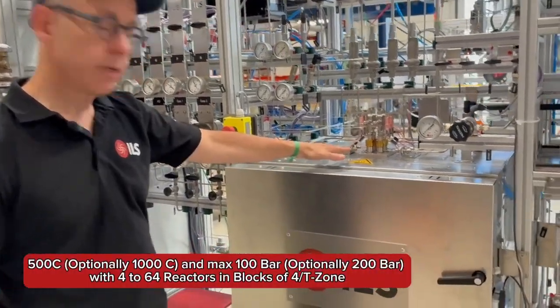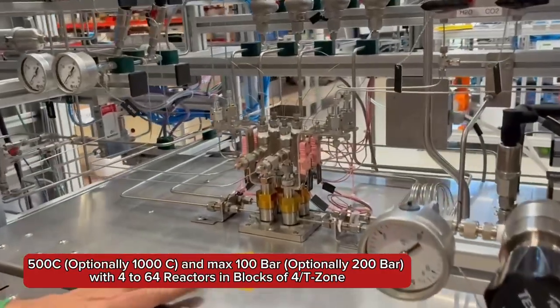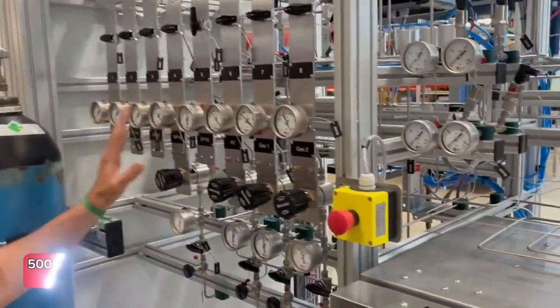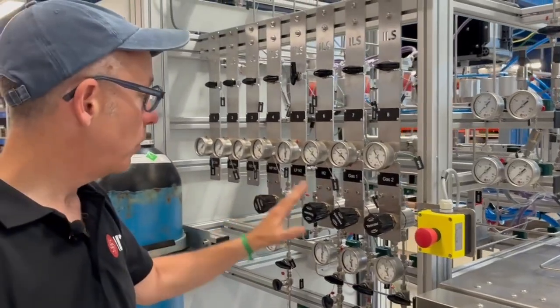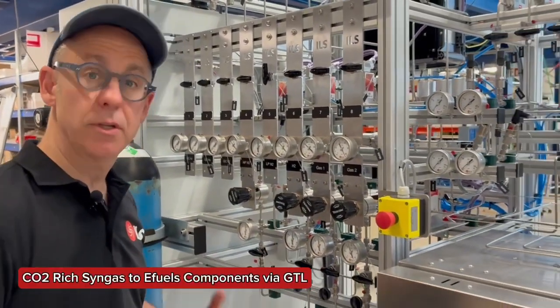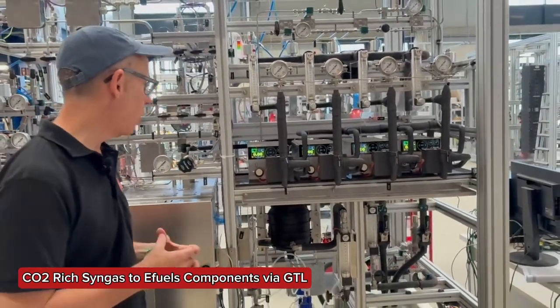We have four parallel reactors here operated at a single temperature, single pressure, with four different feedstocks. We're targeting, in this case, syngas conversion to valorized products like methanol, and particularly we want to be able to convert CO2 as well to various products — in particular methanol, ethanol, alcohols.